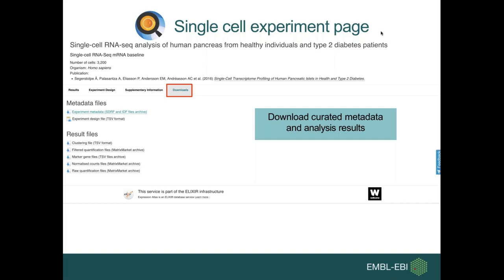What data integration tool is used to integrate data from different experiments? So at the moment, we are processing each experiment separately. It's just that because we are using the same pipeline and the same QC and thresholding methods, these should be broadly comparable. But we are at the moment not really integrating across experiments as such. But it's again something that we're working on.